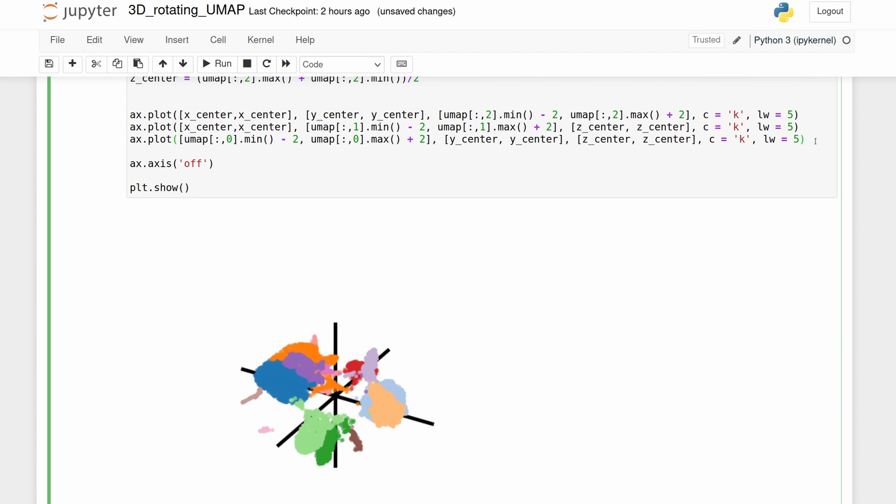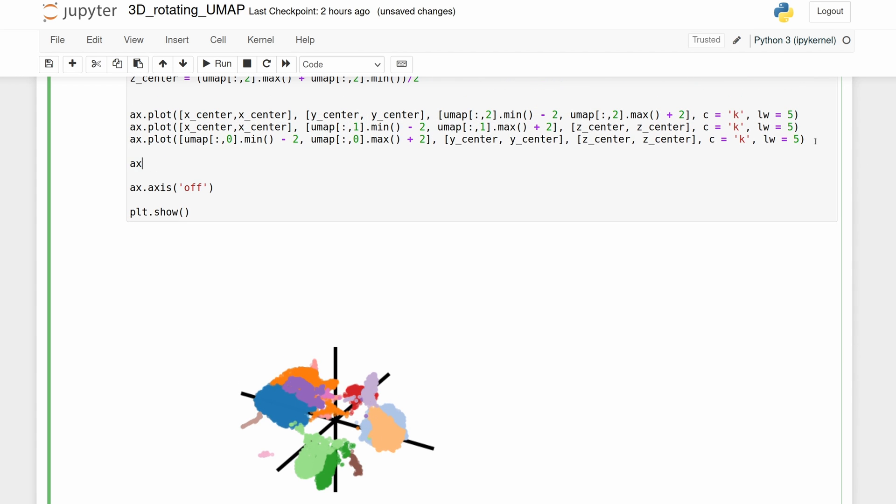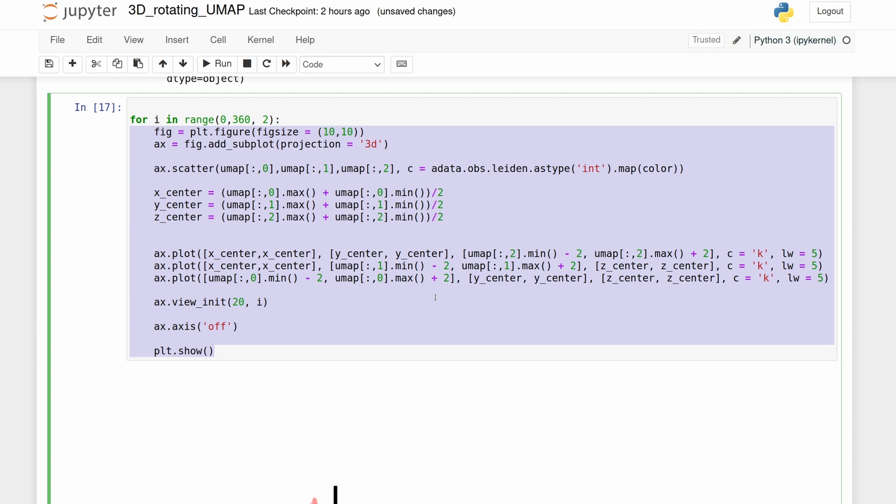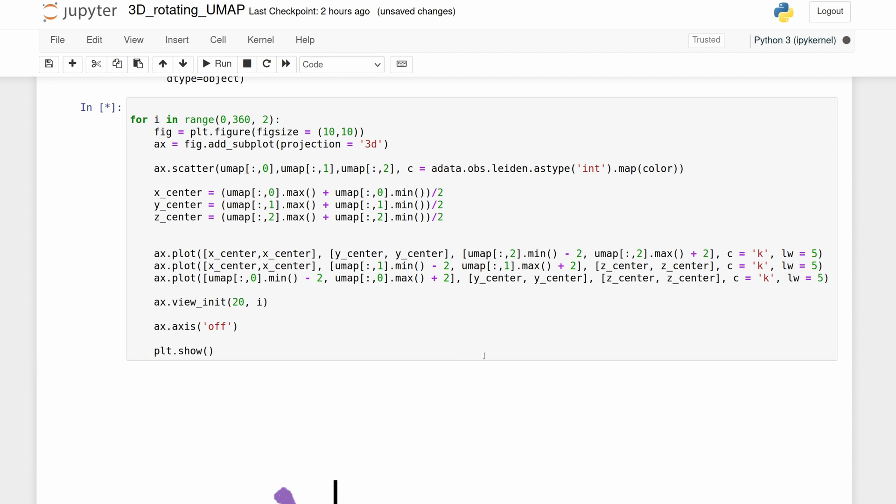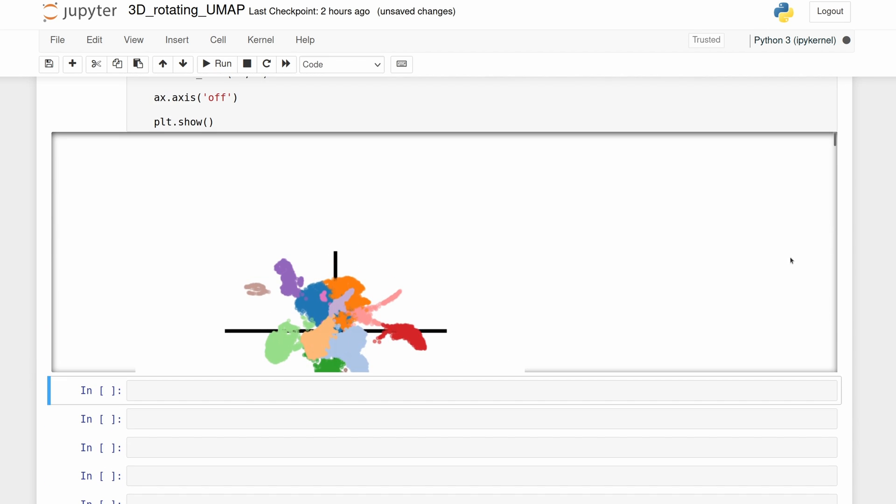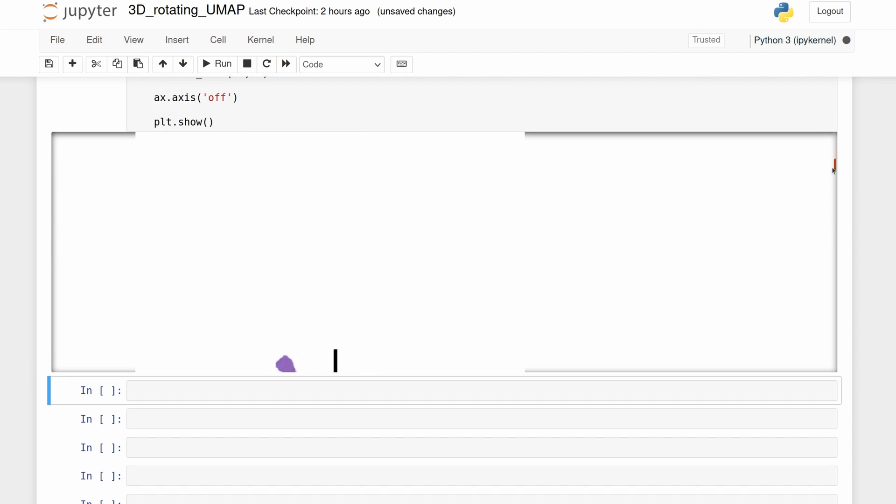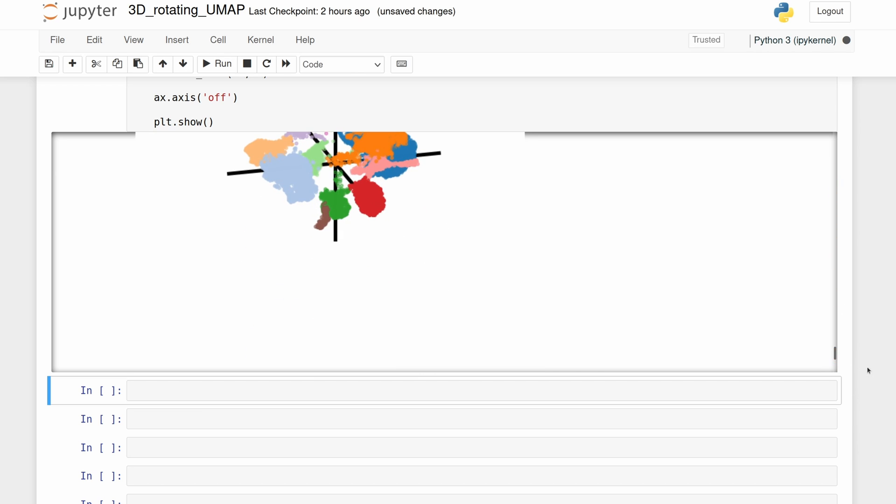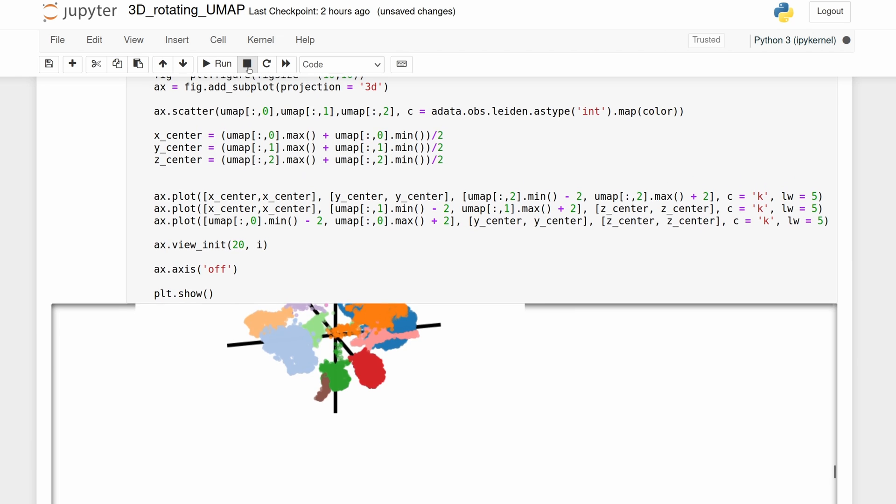Now to make it spin, we're going to use this ax.view. And we're going to keep one angle constant at 20. And then we're going to spin it at i degrees. And since there's 360 degrees in a circle, we're going to spin it 360 degrees in a loop. So we're just going to do a for i in range 0 to 360. And then we're not going to do every single degree. We're going to skip by two at a time. Now we see that this is just running multiple times or 180 different times. But let's just stop it.